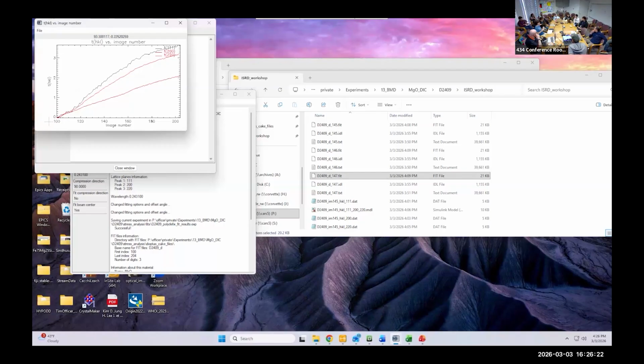And I have another question. Yeah. So to determine what is an acceptable number of peaks when you're doing an experiment, is it repetition, just doing numerous cells to see if you get similar peak results, like how you would tell if the peaks are averaging?